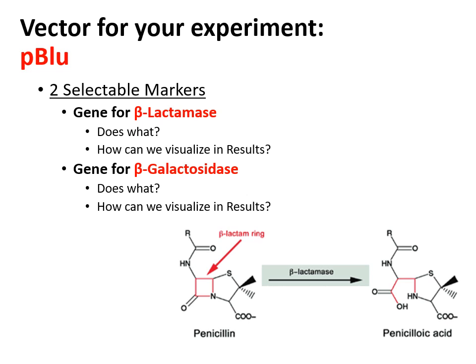The vector, the plasmid, is DNA, so it cannot cut antibiotics. It is the gene that ultimately makes or codes for the protein beta-lactamase that then inactivates the antibiotics. Please circle, star, highlight that fact because it comes back when we go over expected results and when you have to analyze parts of the protocol.